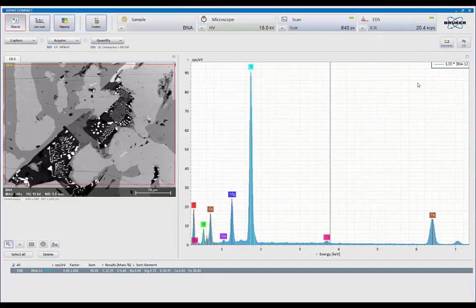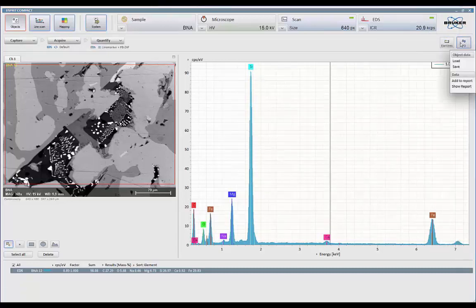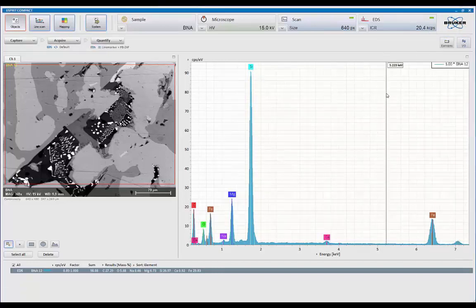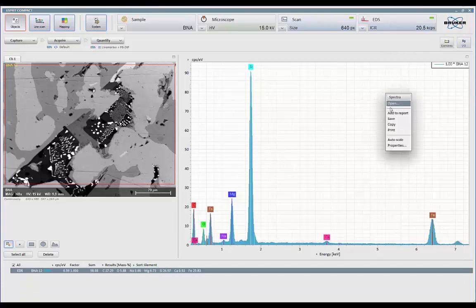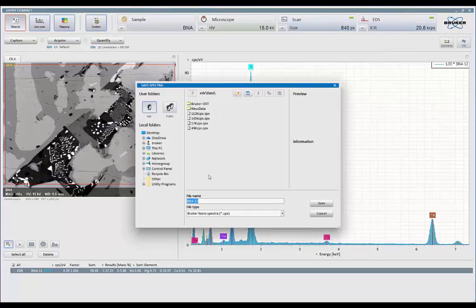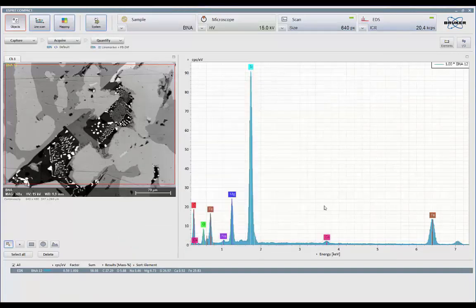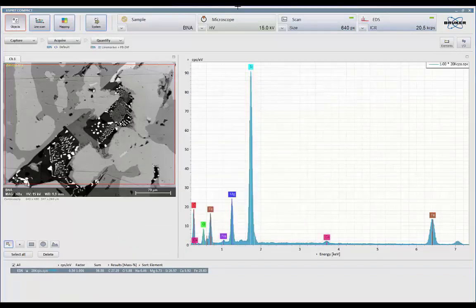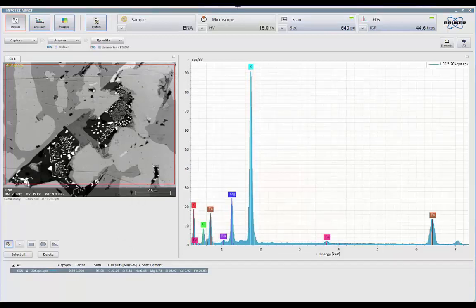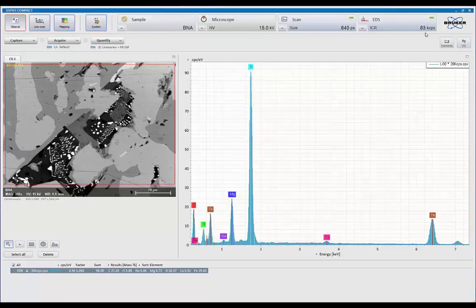Let's save that as a new file. So that was done at 20,000 counts a second. So I'm just going to come in here and press the right mouse button, hit save. And I'm going to say 20k CPS. Let's increase my condenser lens so I can increase my count rate. So let's get it up to, right now we're about 84,000 counts a second.